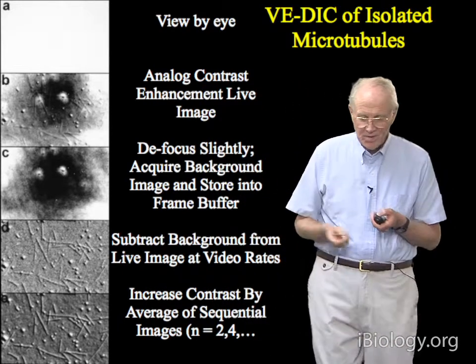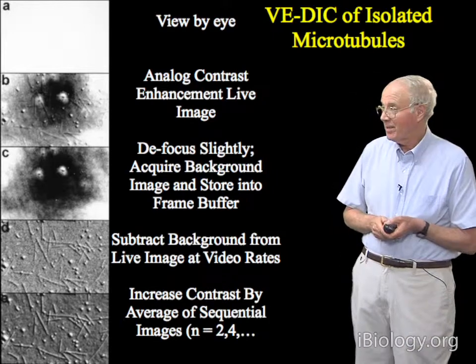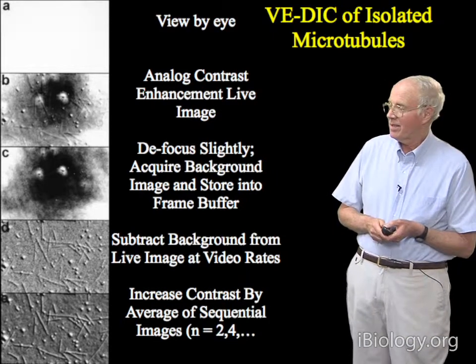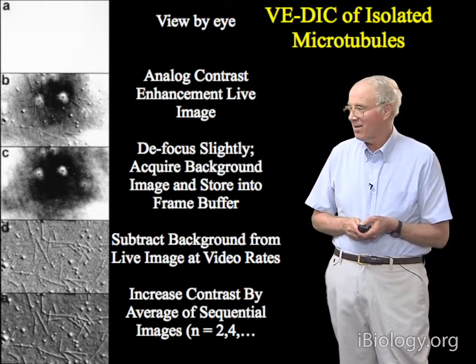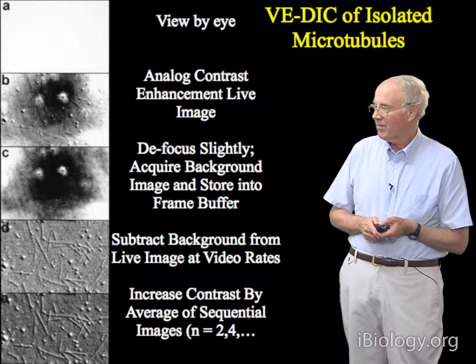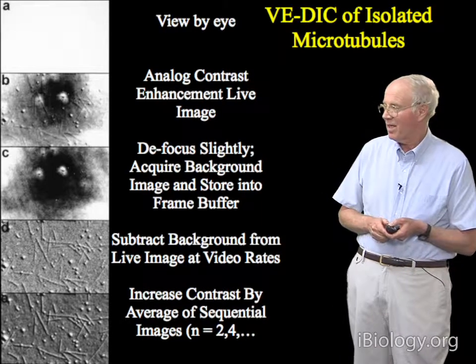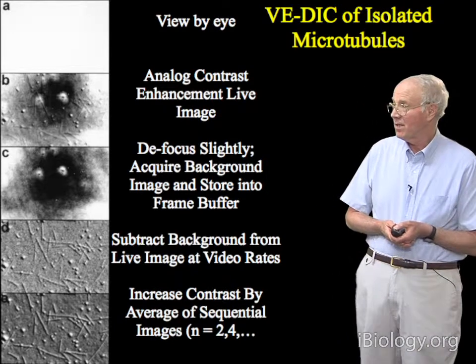So these are very important for video assays, for people who study motor proteins, very important in the life and career of my host Ron Vale, for example, and the discovery of kinesins and other things that they've done. And very important in looking at a lot of the dynamics of cellular fine structure at the limit of resolution.